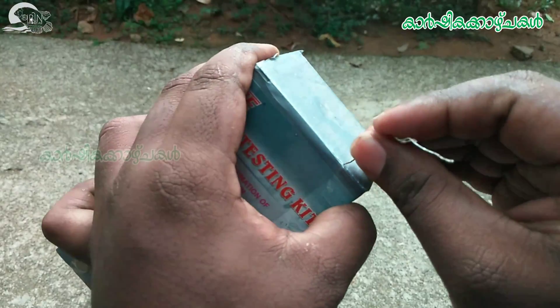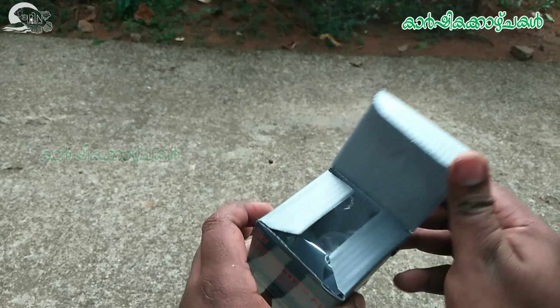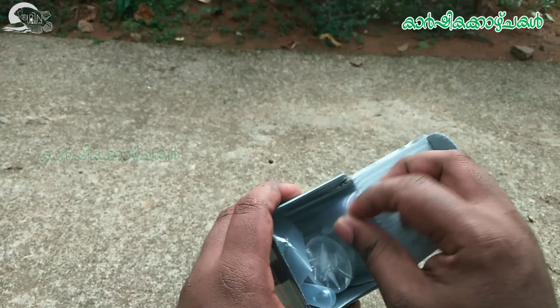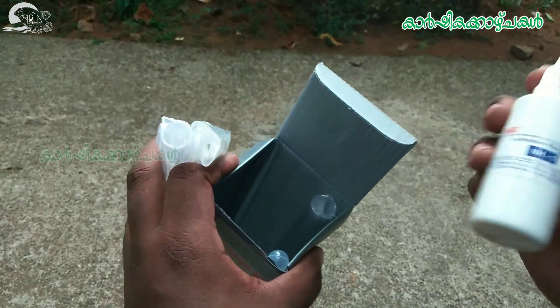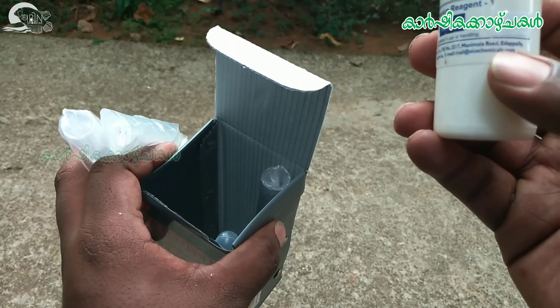I'm going to test this ammonia with a small amount of ammonia. This is a test tube and filler. This is ammonia — 50ml.